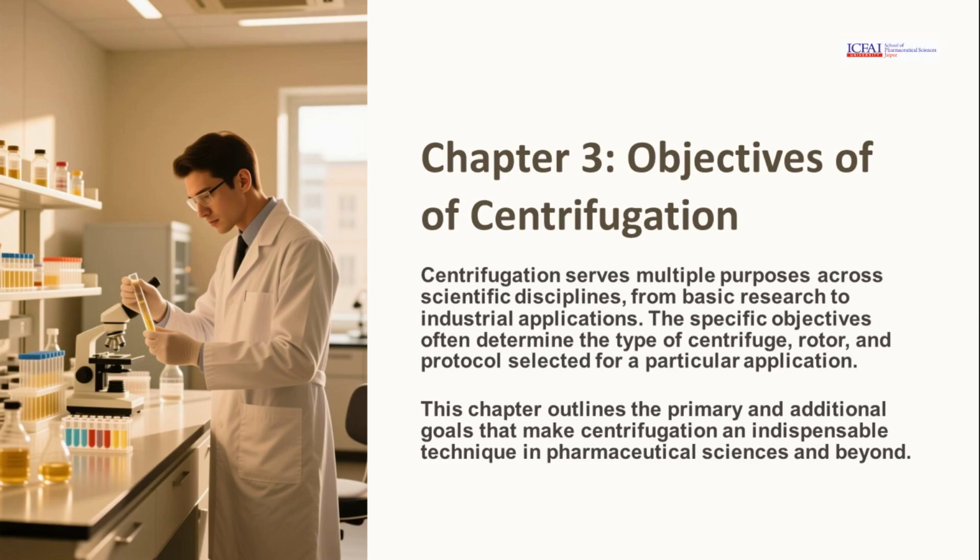Centrifugation serves multiple purposes across scientific disciplines, from basic research to industrial applications. The specific objectives often determine the type of centrifuge, rotor, and protocol selected for a particular application. This chapter outlines the primary and additional goals that make centrifugation an indispensable technique in pharmaceutical sciences and beyond.